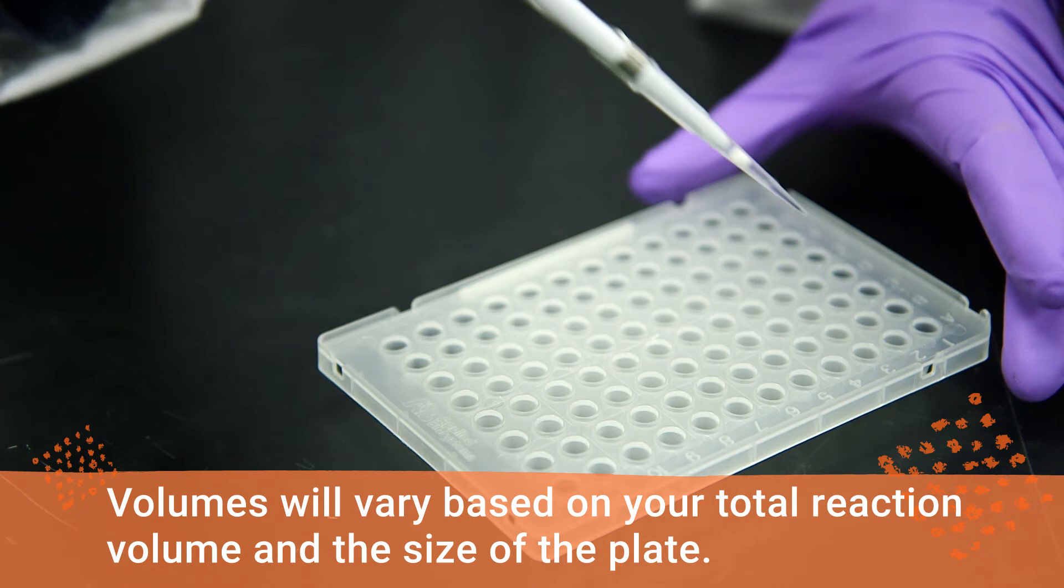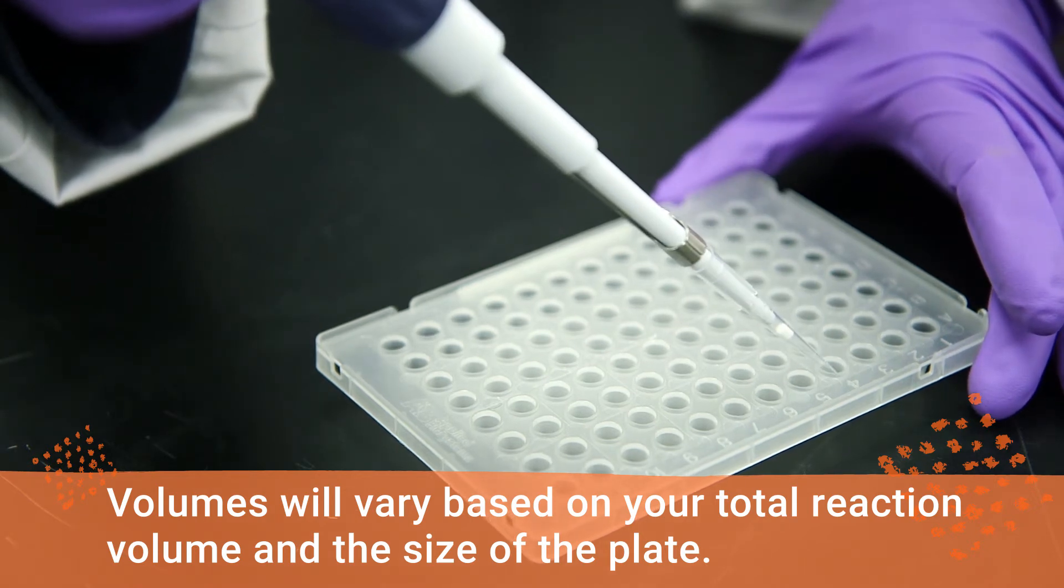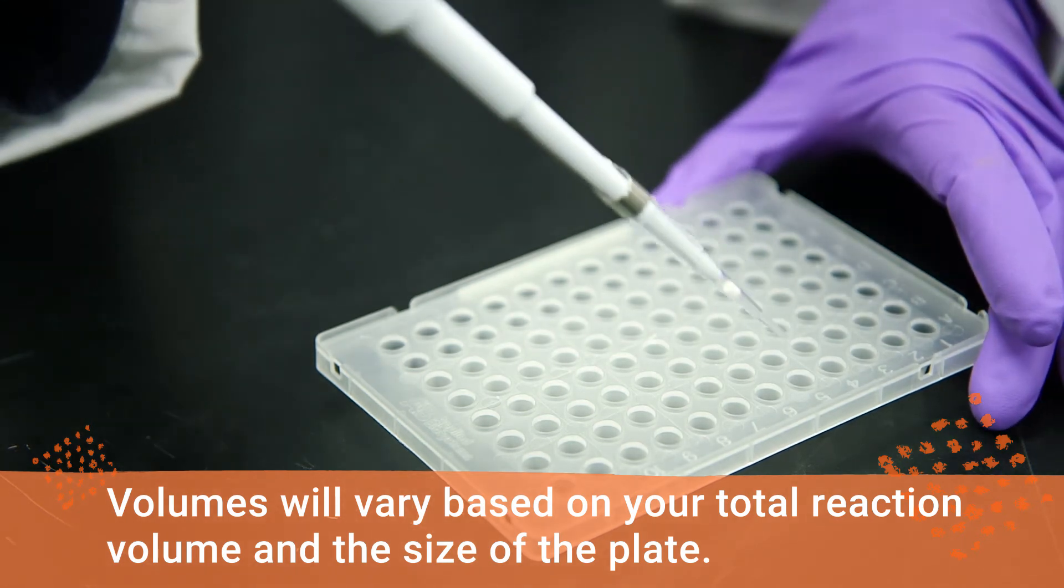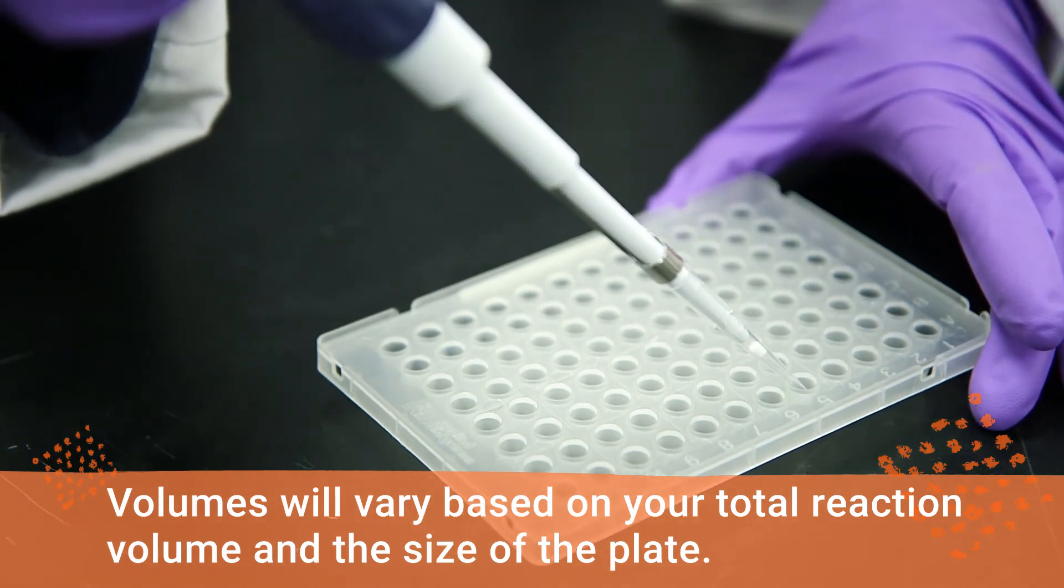This volume will vary based on your planned total reaction volume and the size of plate you're using. But in general, you'll want the sample volume to be under 20% of the total reaction volume.